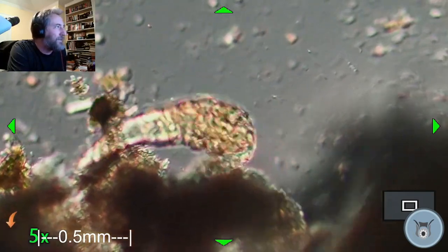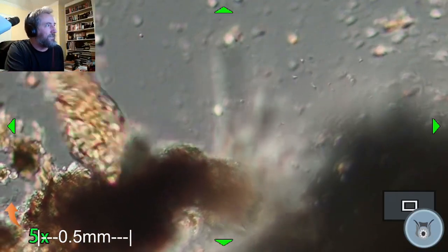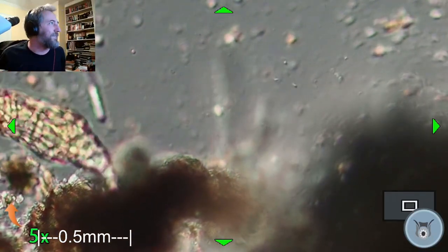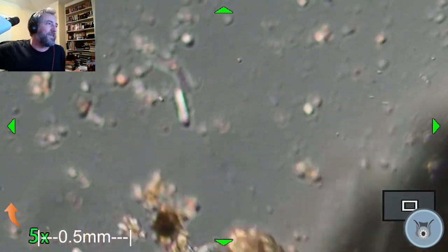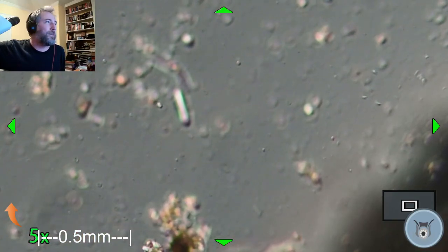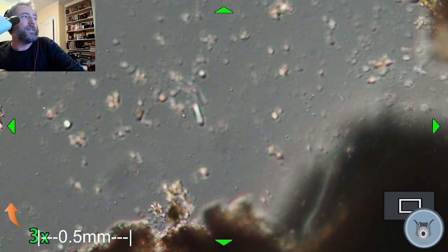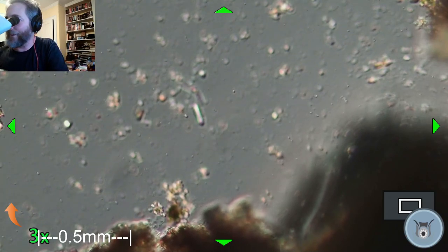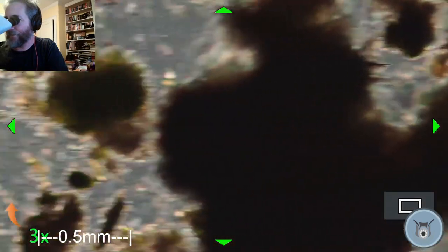You can see there's a little, oops, didn't mean to do that. Off the top of it, well, it's a little too active. Let's see if I zoom out a level, maybe we can keep it in the field of view long enough for me to point at it, but it's got sort of a little appendage sticking off its head, which is called an antenna. Where'd he go? Where'd she go, rather?